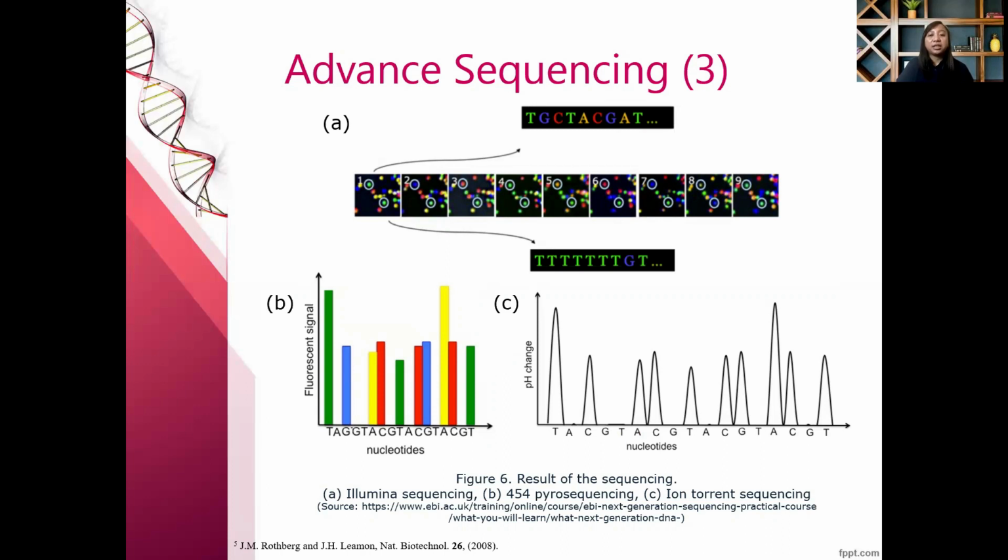Template DNA clusters are formed on a flat medium. In each cycle, four types of fluorescent dNTPs are added, and a blocker is added so that in each cycle there is only one dNTP attached to the DNA template. In each cycle, there is a check for the fluorescence color.